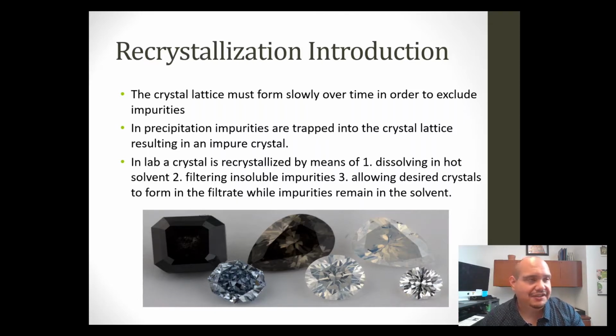The place to make sure that a crystal should have a specific color, whether it be purple or pink or blue or green or whatever it is, is the CRC. Bromocresol green happens to be green. Copper sulfate happens to be blue. There are different crystals that are different colors. So if you recrystallize something and it doesn't come back clear and colorless, that doesn't mean you did anything wrong. It could just mean that the chemical makeup of that specific compound just so happens to have that pigment that's still there. Okay?